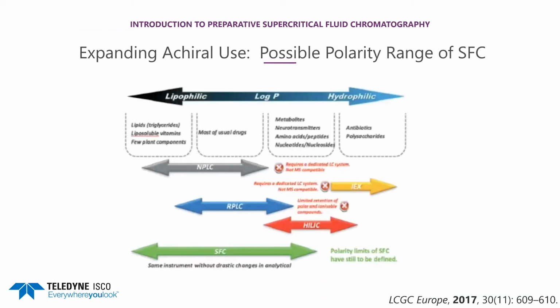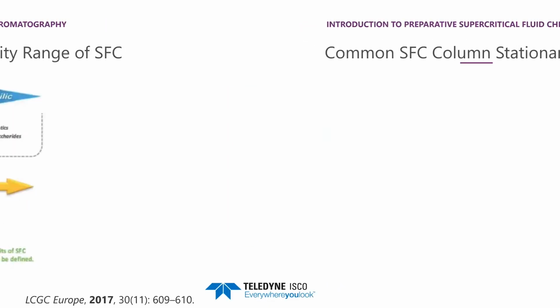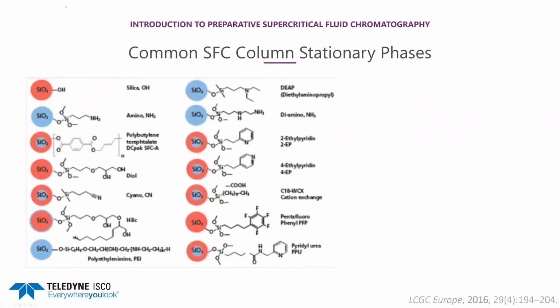SFC works with a wide polarity range greater than LC, which means there is a greater ability to purify compounds. Carbon dioxide is nonpolar like hexane and works very well to replace chlorinated compounds.